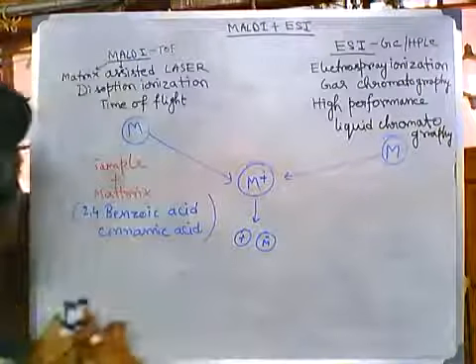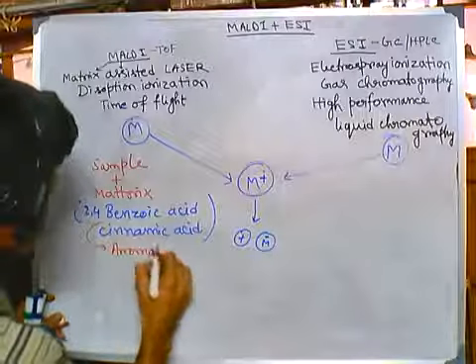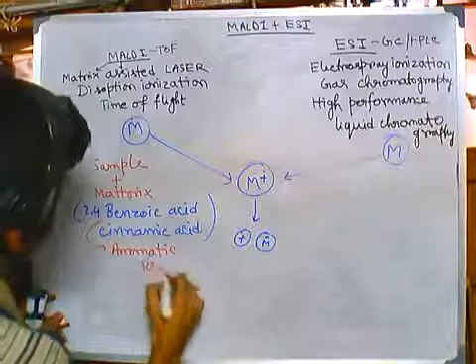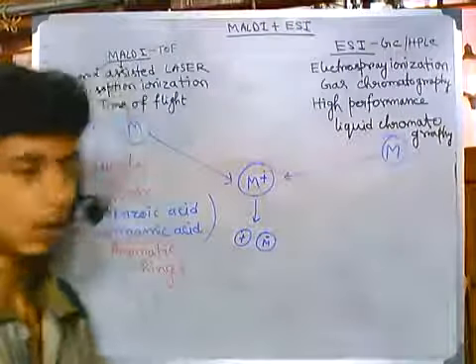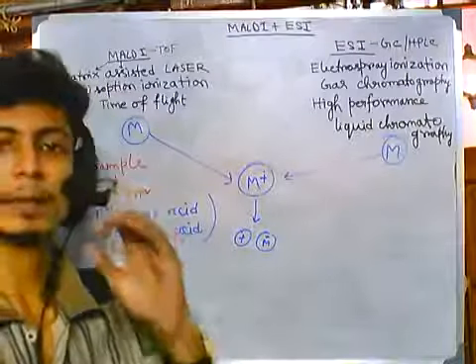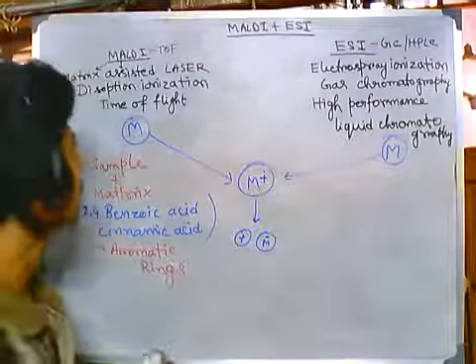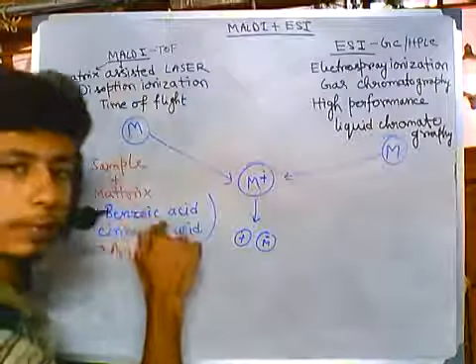Now having these aromatic rings is very, very important. Having aromatic rings is very important for this process. Now what we have discussed till now, the samples are entrapped into a matrix. This is called the sample preparation phase. After that, what we need to do is utilize a laser to hit onto this sample.